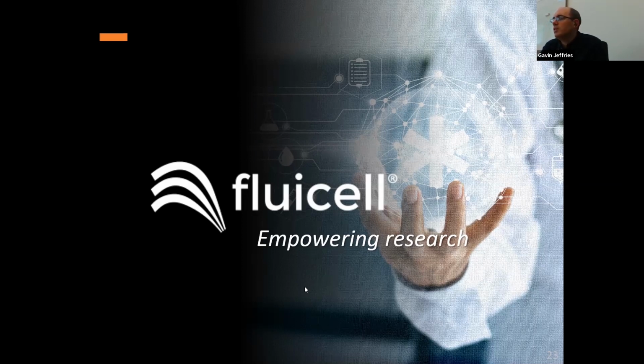One of the things that is very good with this type of technology is that because everything happens at the tip of a device, and this tip can be moved in 3 dimensions, arguably, as long as the cells will stick or be captured by the surface, then you could overprint onto anything, as long as you can translate around the objects quite freely.